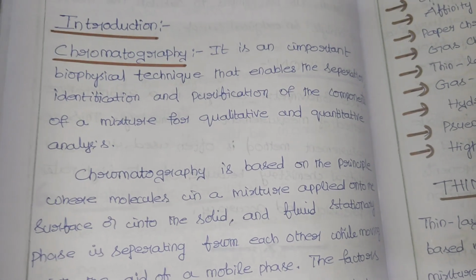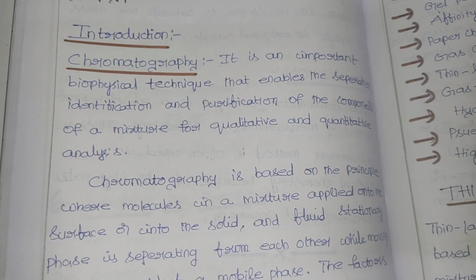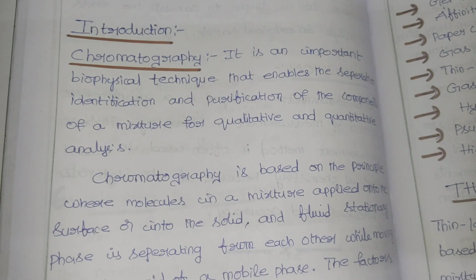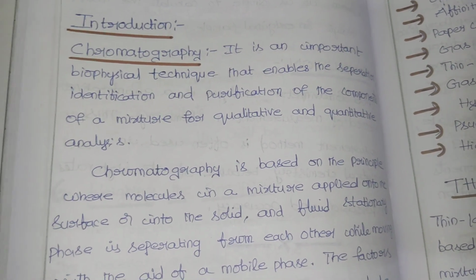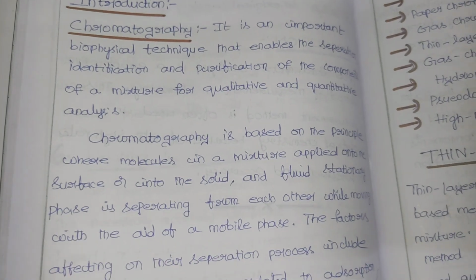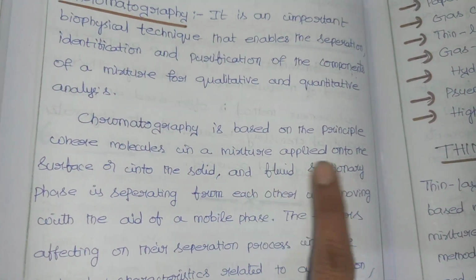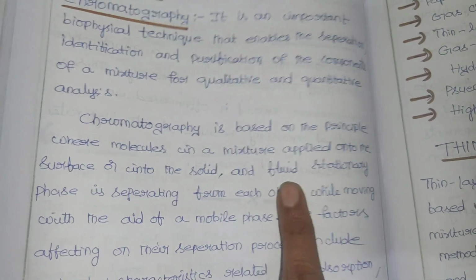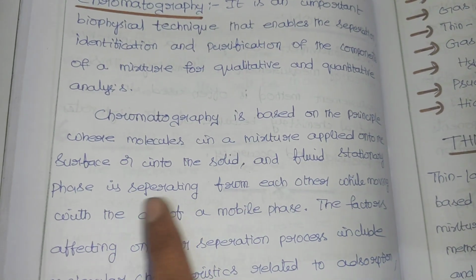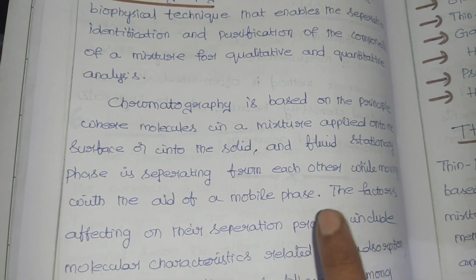So it will help to separate the components of a mixture so that we can identify and purify them. It is also used for both qualitative and quantitative analysis. It is based on the principle where molecules in a mixture applied on the surface or into the solid or fluid stationary phase are separated from each other while moving with the aid of a mobile phase.